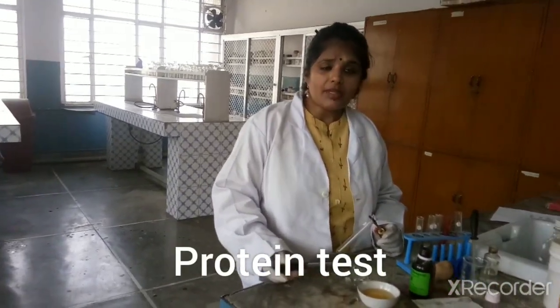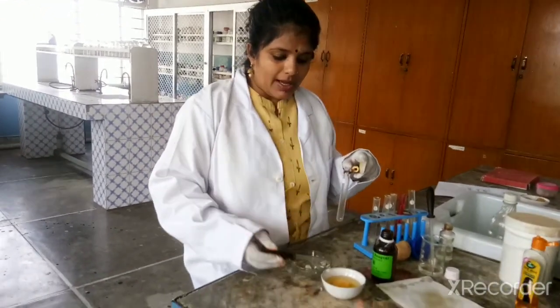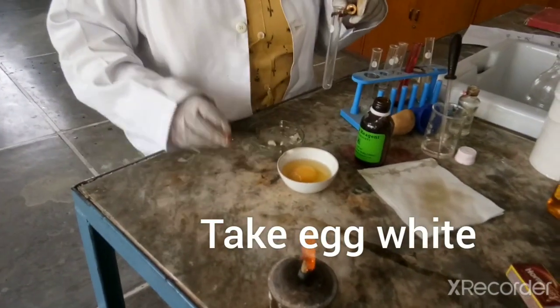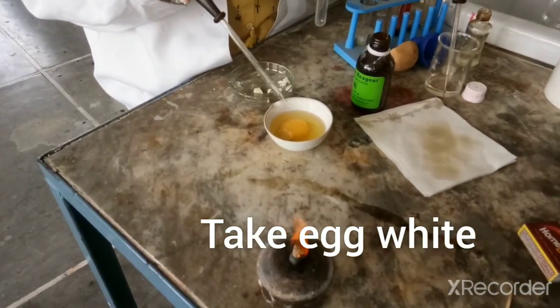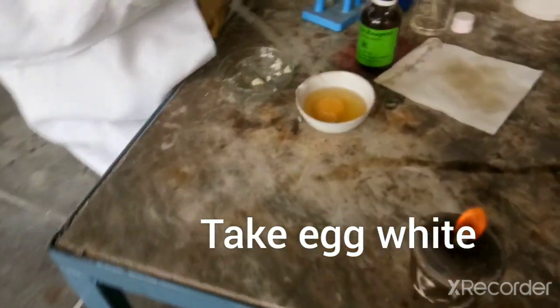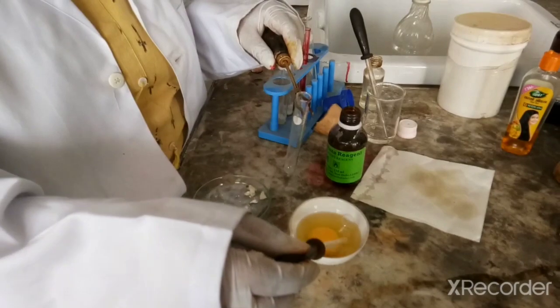In this video we are going to test for protein. For the protein test you can take any protein product, but if you take the egg white part then it will be very comfortable. I have taken one egg and broken it down. This is the yellow part of the egg which is known as yolk, which we are not supposed to take. This is the white part of the egg which contains a protein called albumin. We will take a few drops of albumin protein, or egg white part.